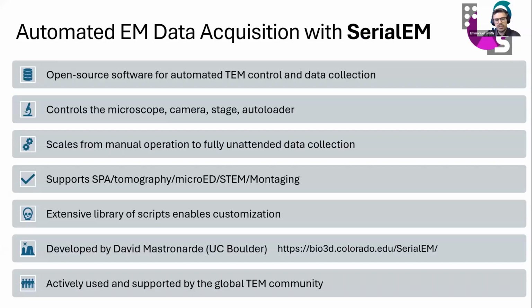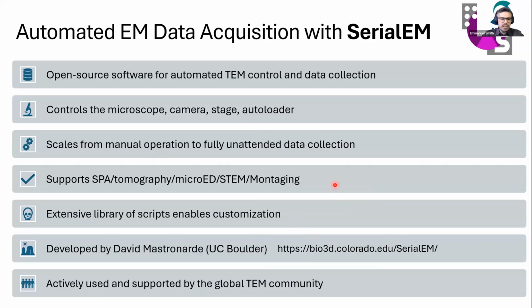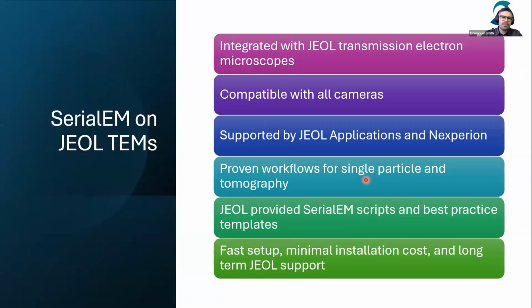Now, SerialEM also includes an extensive library of scripts that enables further customization and automation. It's developed and supported by David Mastronarde at UC Boulder, and here is the website for SerialEM. Let me also turn on my pointer. Okay. It's actively used and supported by the global TEM community.